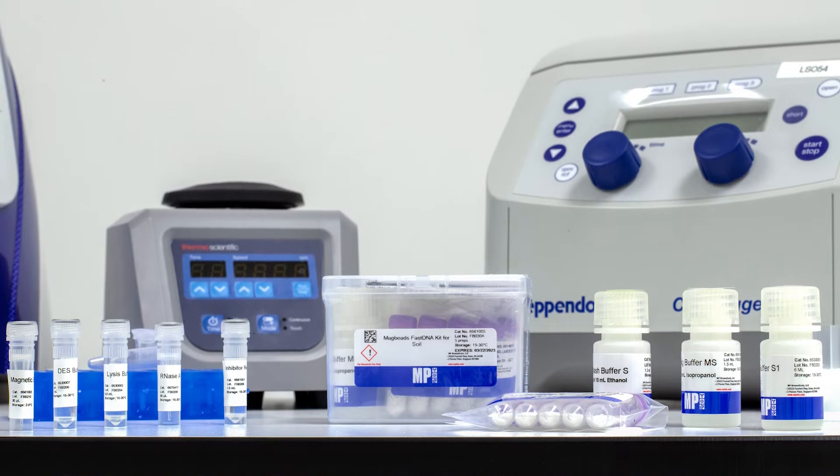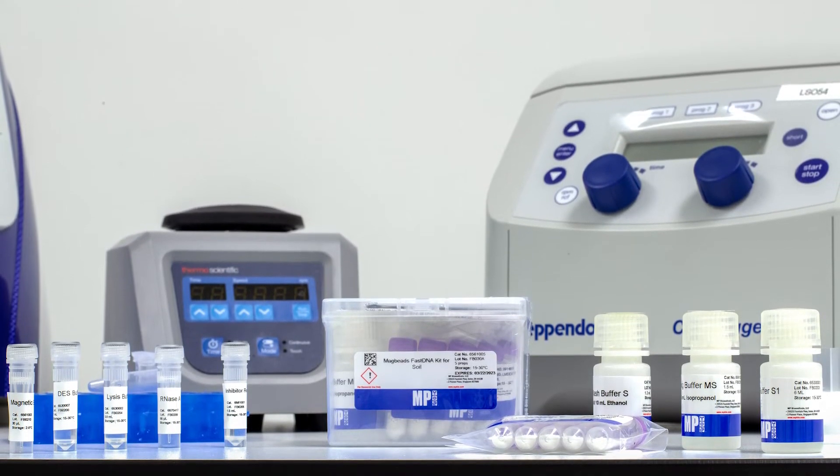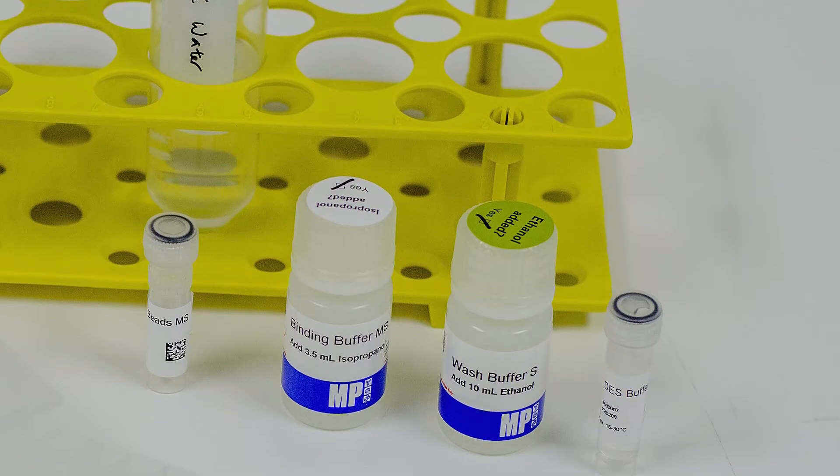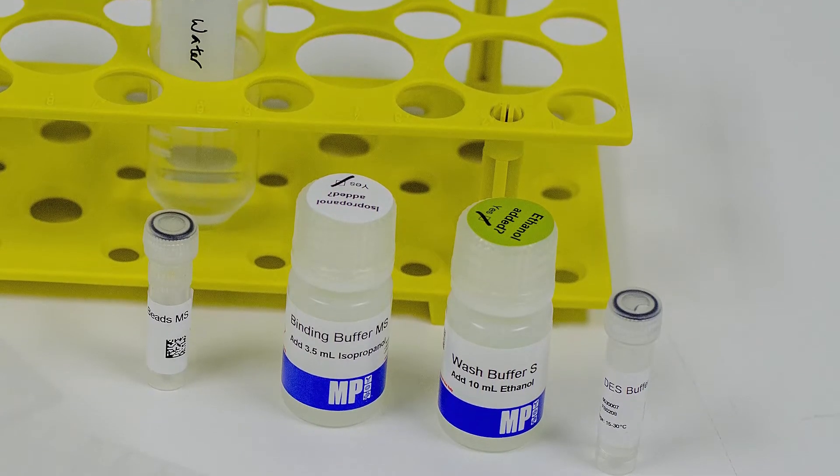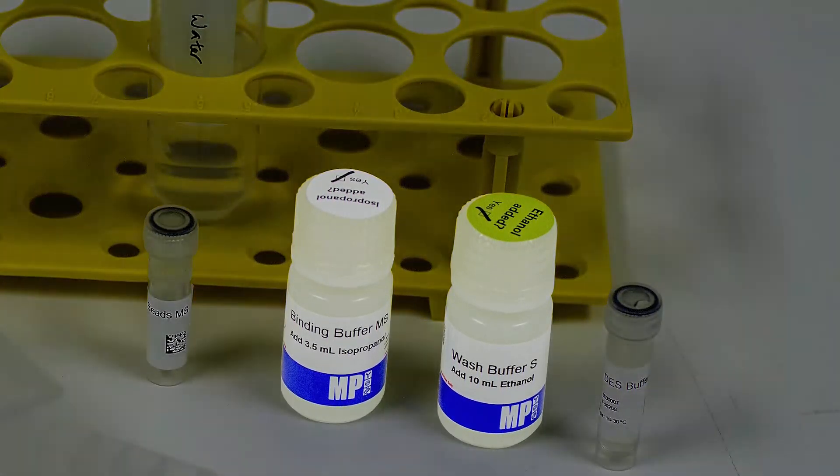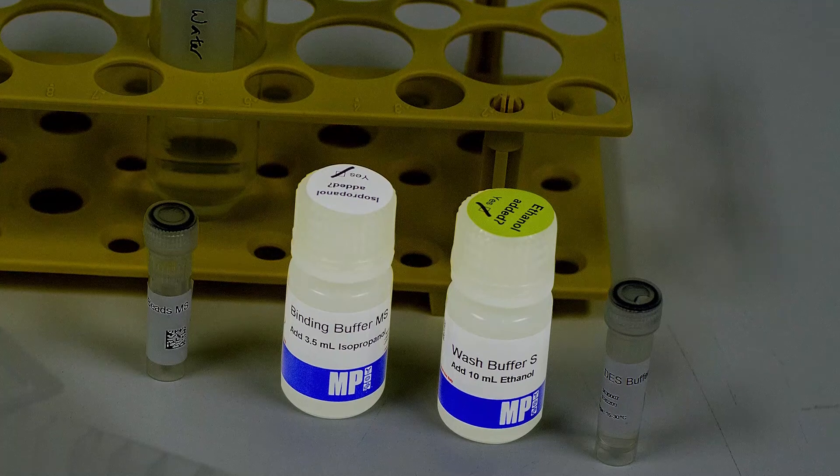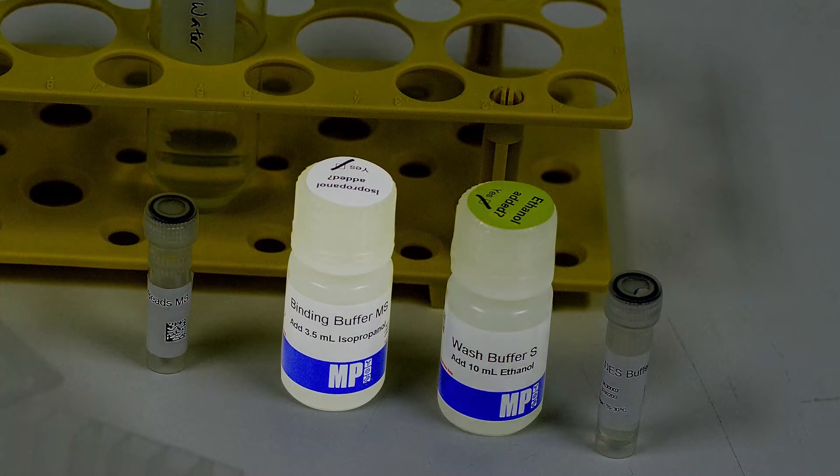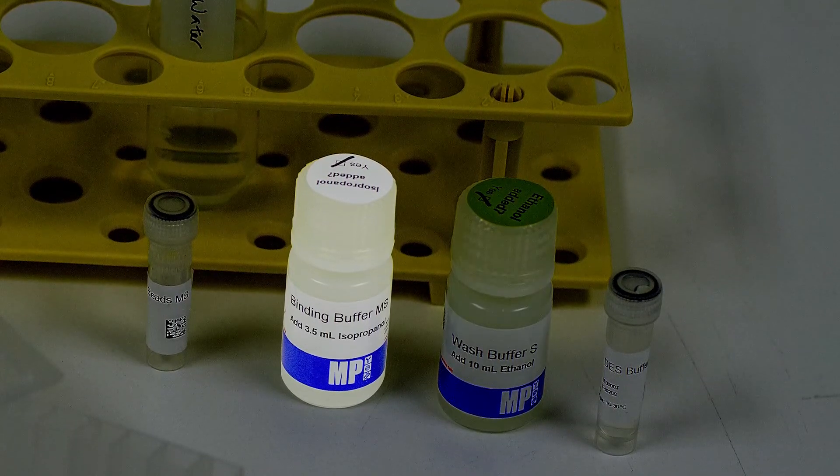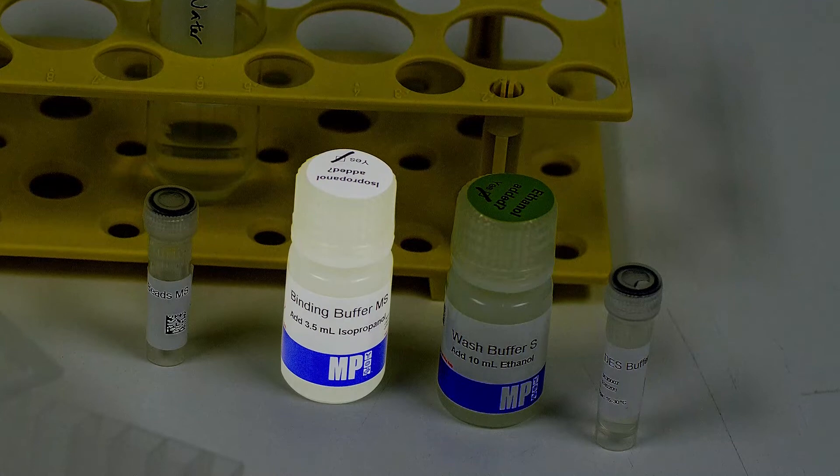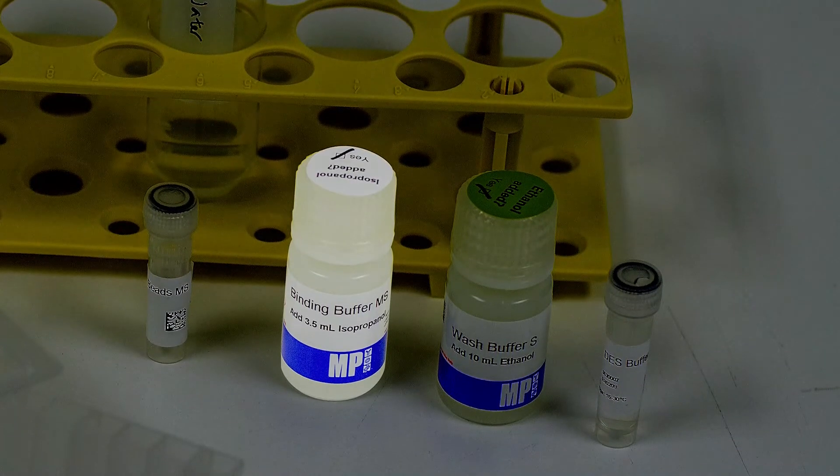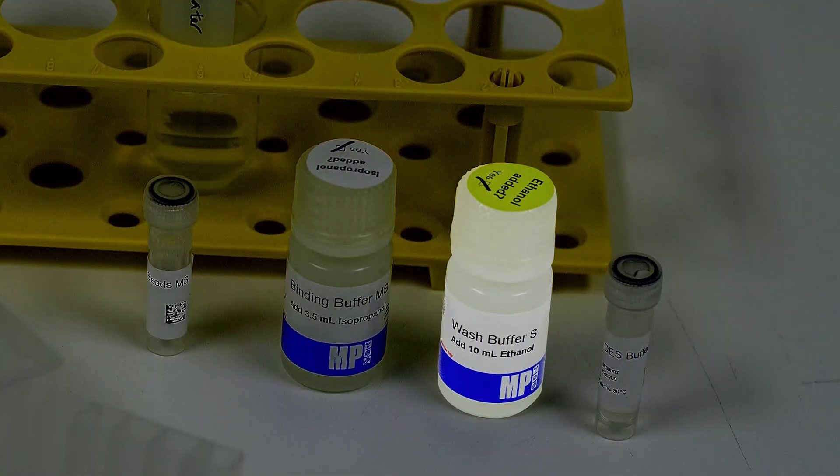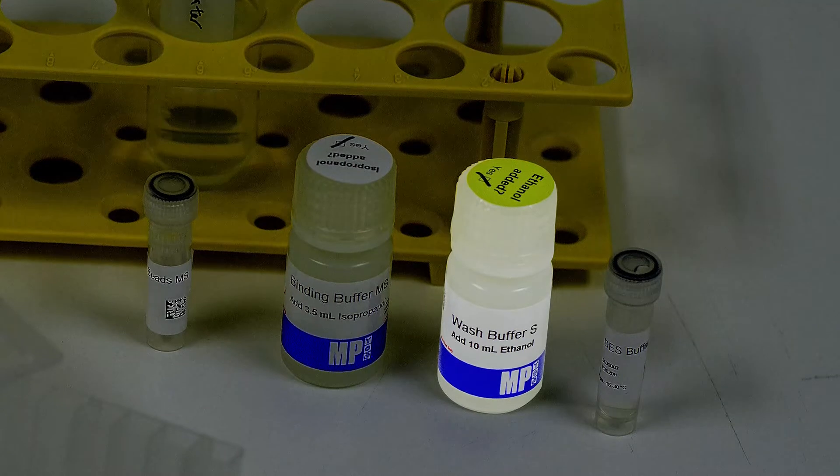For the purpose of this demo video, we will be using the sample kits of MacBits FastDNA Kit for soil. When using the MacBits Kit for the first time, be sure to add the recommended amount of isopropanol and ethanol to binding buffer MS and wash buffer S respectively. For the sample kit, we add 3.5ml of isopropanol into binding buffer MS bottle and mark it. We also add 10ml of 100% ethanol into wash buffer S bottle and mark it.